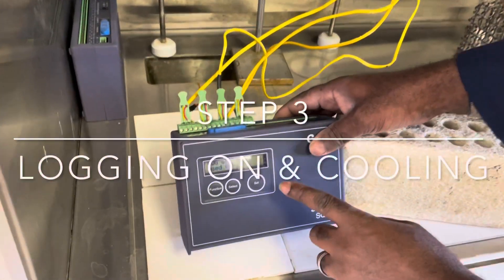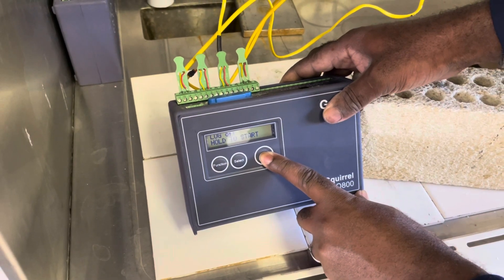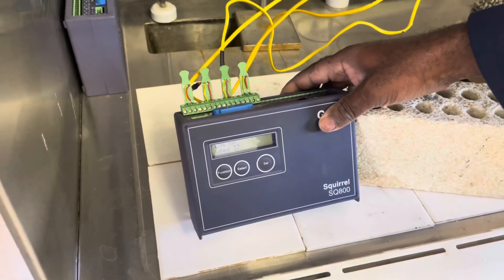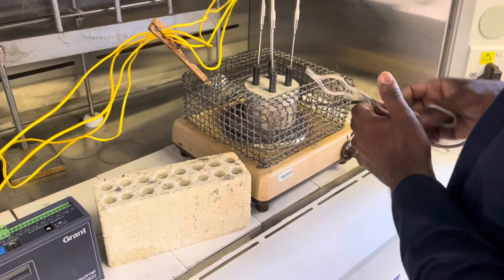To ensure that your data logger is set to logging on, first press function to check the setting, and thereafter press set to set the data logger to logging on.